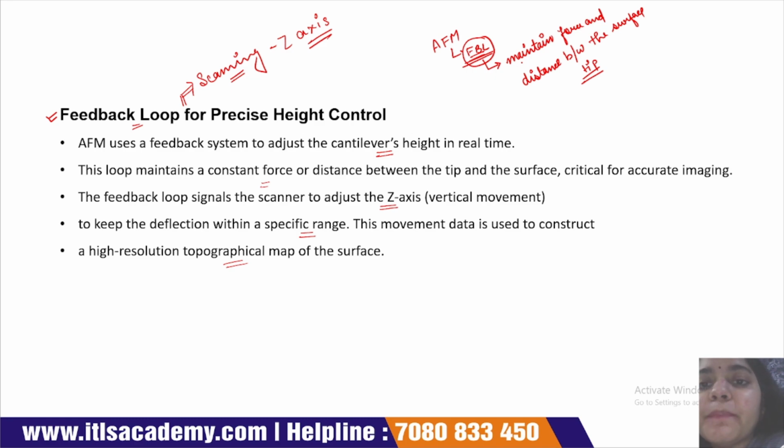Why do we maintain the force and distance between the surface and cantilever? Because we want a high resolution image.